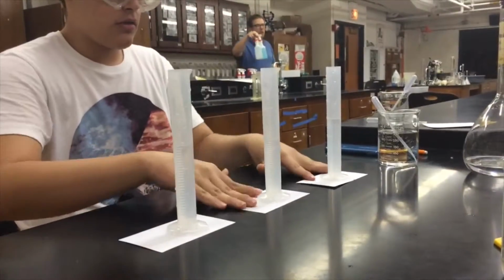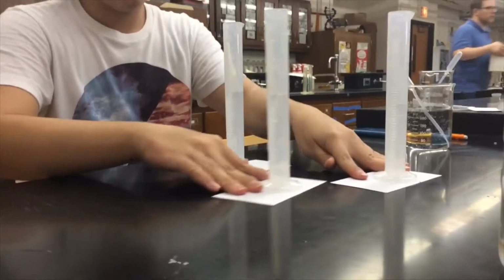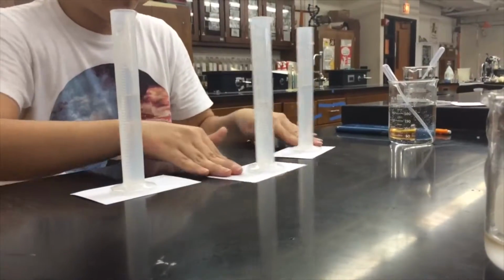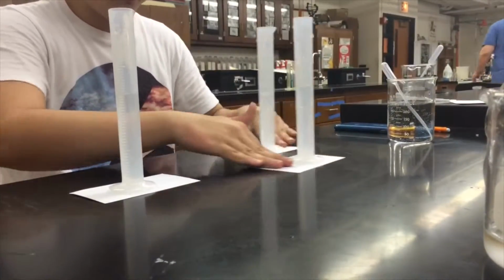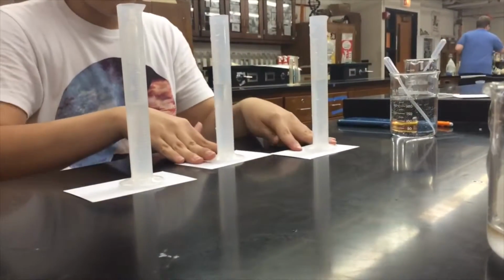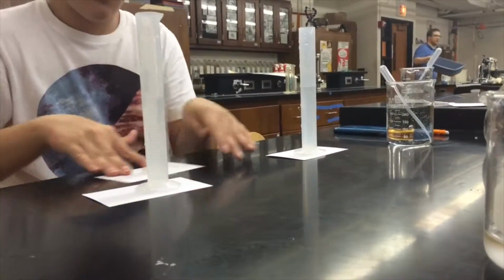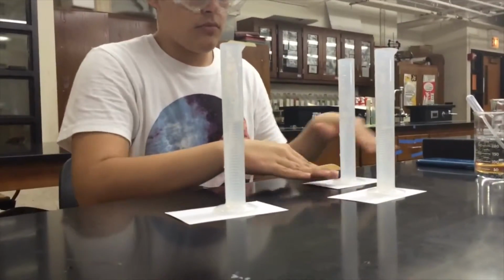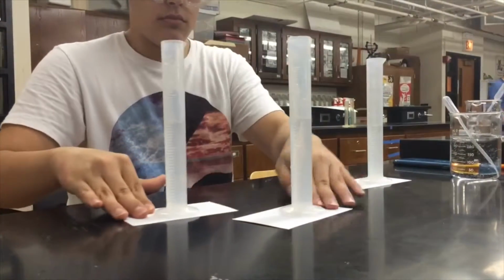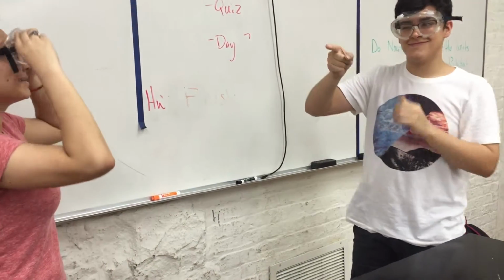Now that we got the hang of the experiment, we decided to have some fun and create a game. We made 3 different solutions of potassium iodate and shuffled them around just so we didn't know which was which. Then we will play rock, paper, scissors to see who chooses first. But remember, always wear goggles.